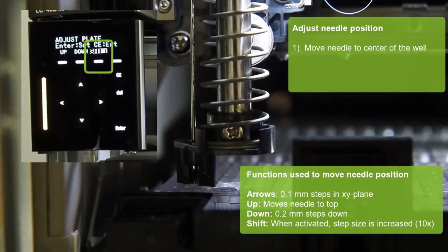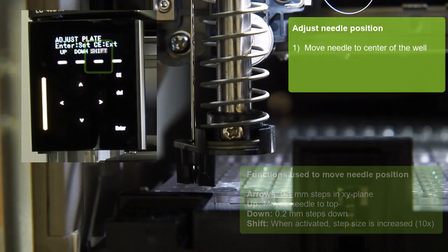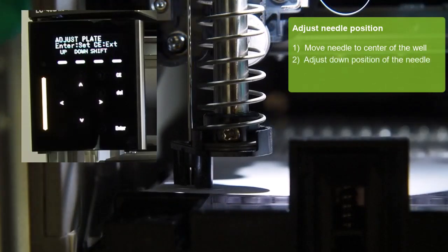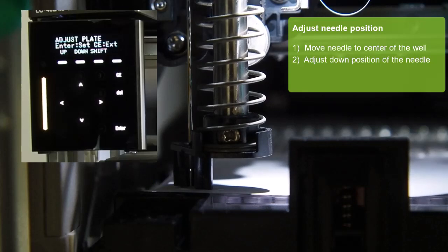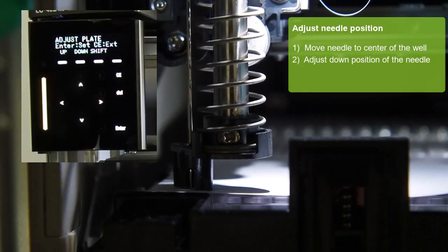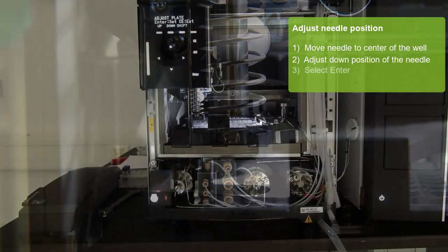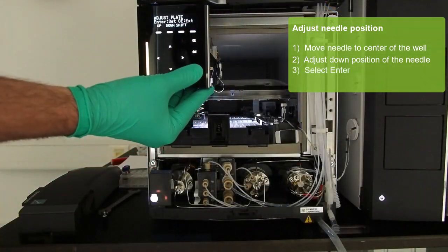Activating shift means that the step size is increased. Use a sheet of paper to see when the down position is appropriate. This is the case as soon as the needle slightly touches the paper but you can still move it. Select enter once you are happy with the position for the well.